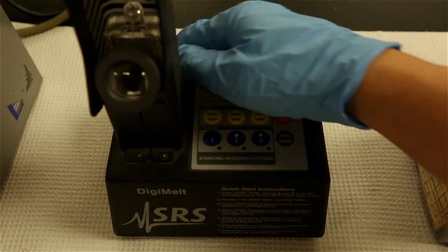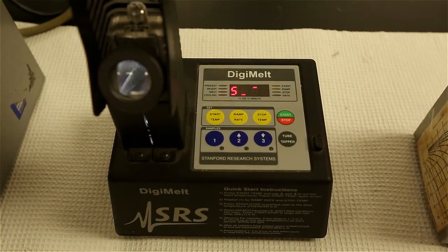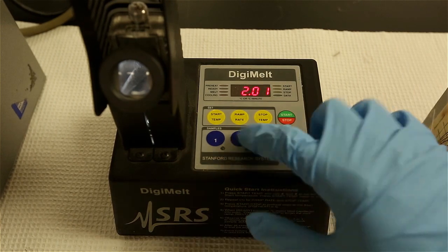The melting point range is indicated by the onset of the physical changes such as darkening of the sample or forming a clear liquid.